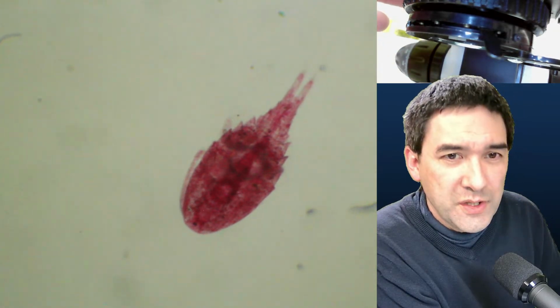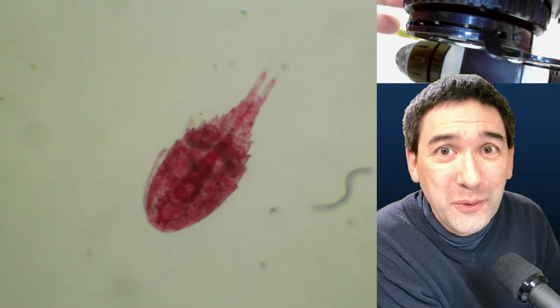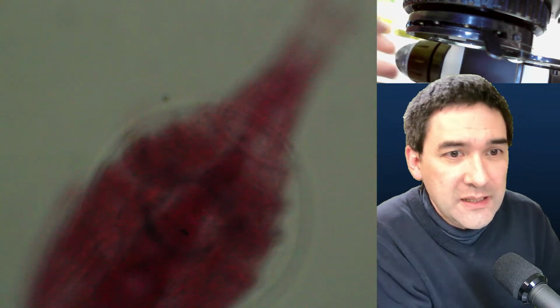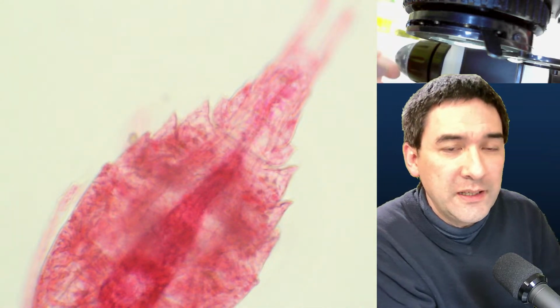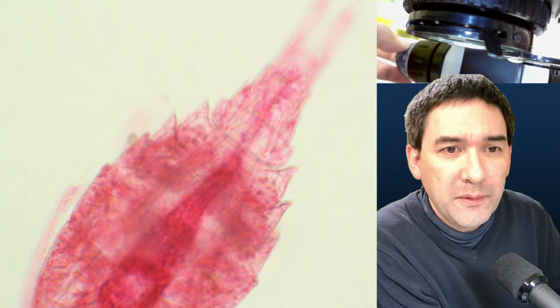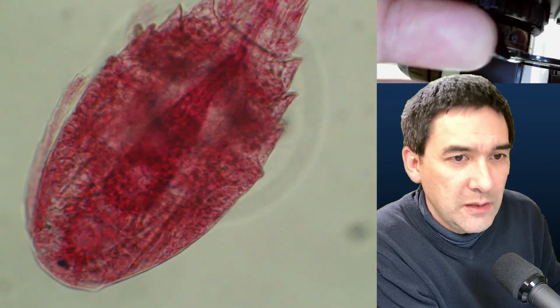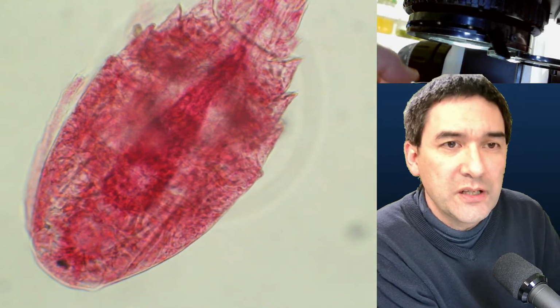And, of course, I think they're always more interesting alive, but difficult to observe when they're alive because they're moving around so quickly, okay? So what I would like to do now is I go again to my 10x. This is how it looks like. It needs to go up with the light intensity so that there is less grain in the image. Okay, I'm now closing the condenser more. Okay, so that's how it looks like, right?